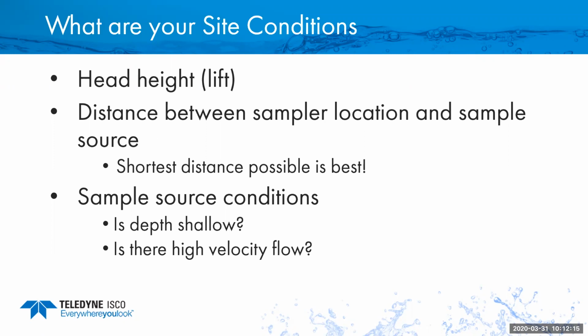There are also vacuum samplers that don't have a mechanical pump like that. They work with a little AC motor vacuum pump, and those can have line lengths up to 300 feet. And you don't have to worry about changing pump tubing. So if you have a really long suction line, over 100, 200, or 300 feet, then you definitely want to consider a vacuum type sampler.